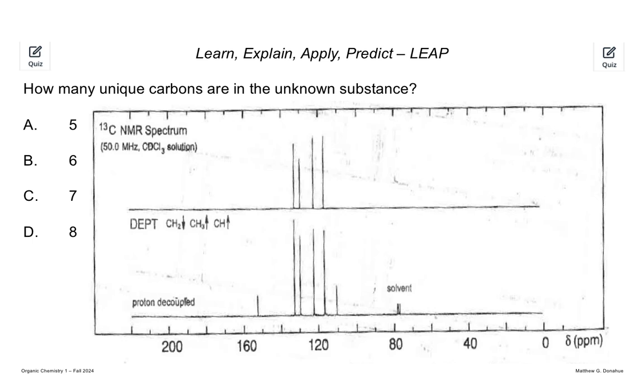What else can you say? How do you interpret? See how there's 6 and then there's only 4 here? So what are those two? Just C. They have no hydrogens attached to them. So 6 carbons, 2 with no H's.